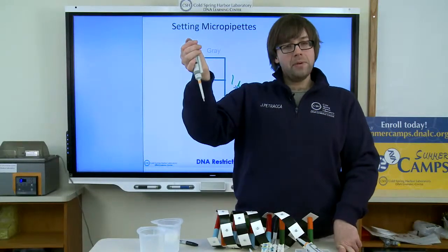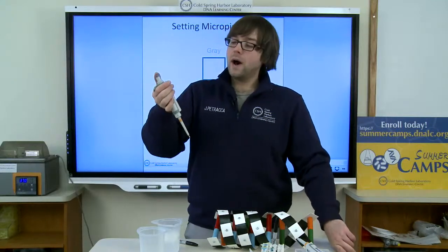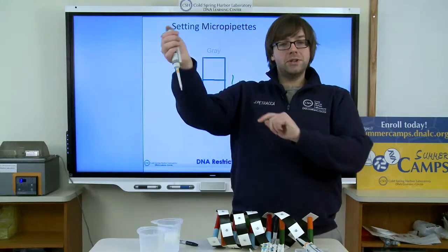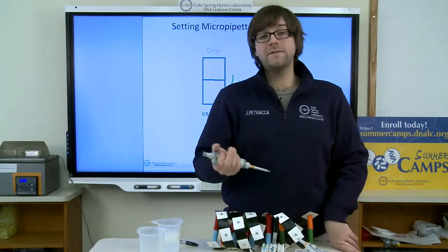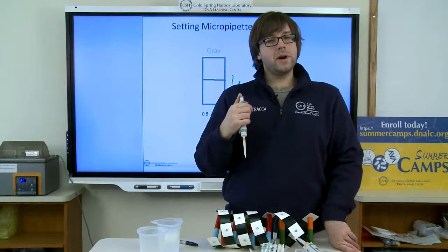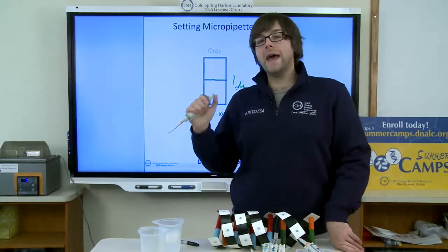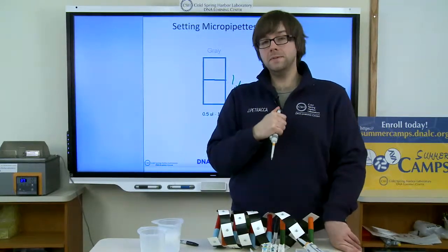The first stop is primarily just for measuring. Because we want to be precise, if we set the numbers for a certain value, we can push down to the first stop and take up a liquid, and we can be confident in the volume of liquid that we've taken up. The second stop has a little bit of a different purpose. That's essentially there to help push every last drop of liquid out of the pipette when you're transferring liquids from one place to another.